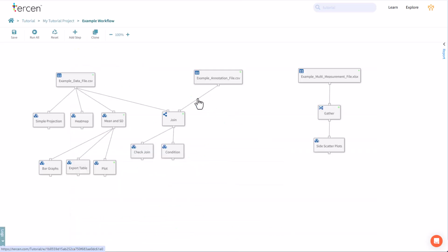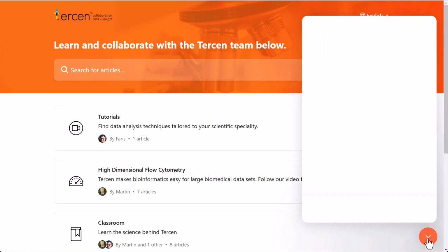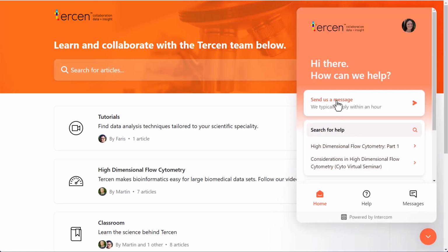Now you should have the basic skills to navigate Tercen and start your data analysis. Feel free to go to the Learn section where you can search for help articles and tutorials, or click on the chat widget to contact us directly.